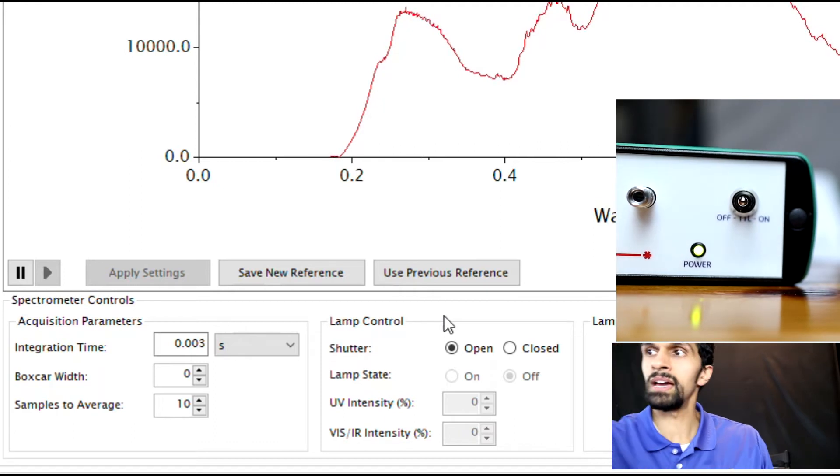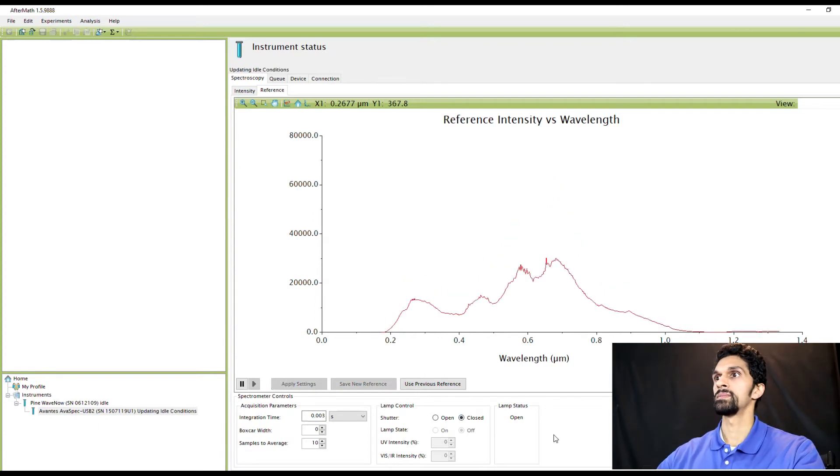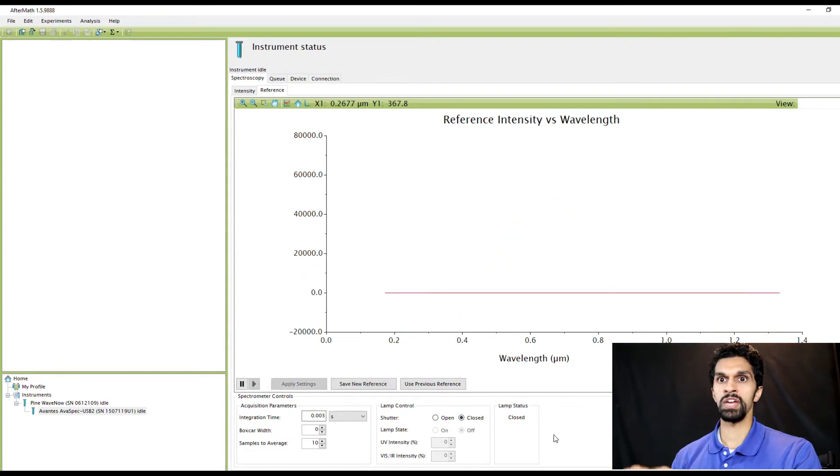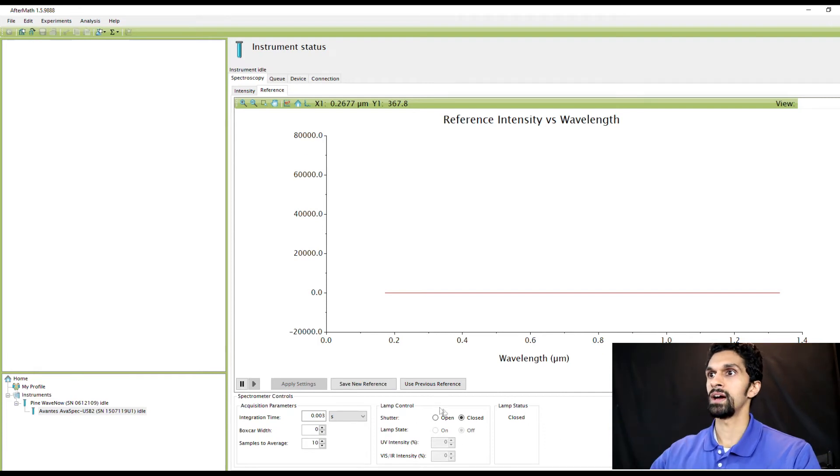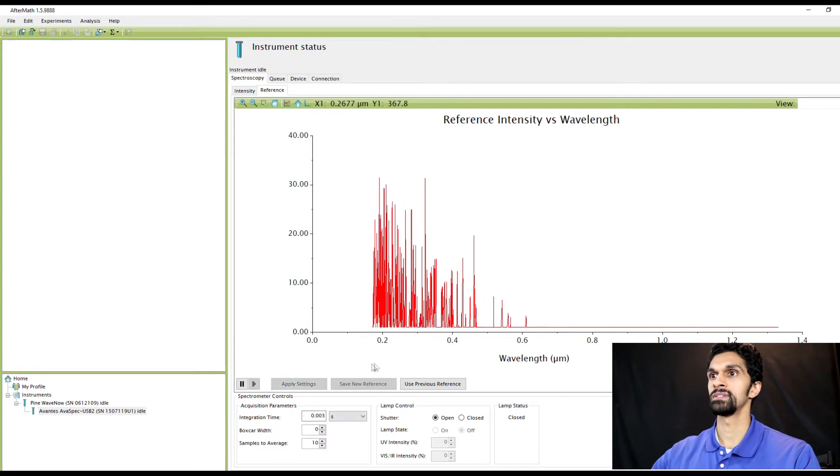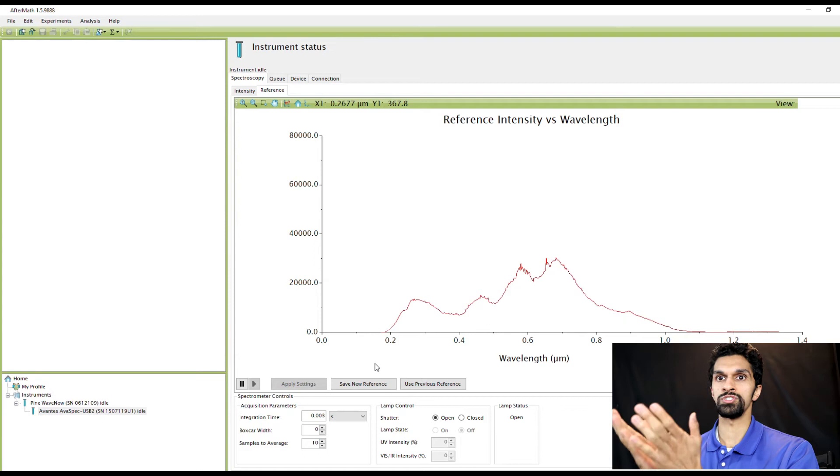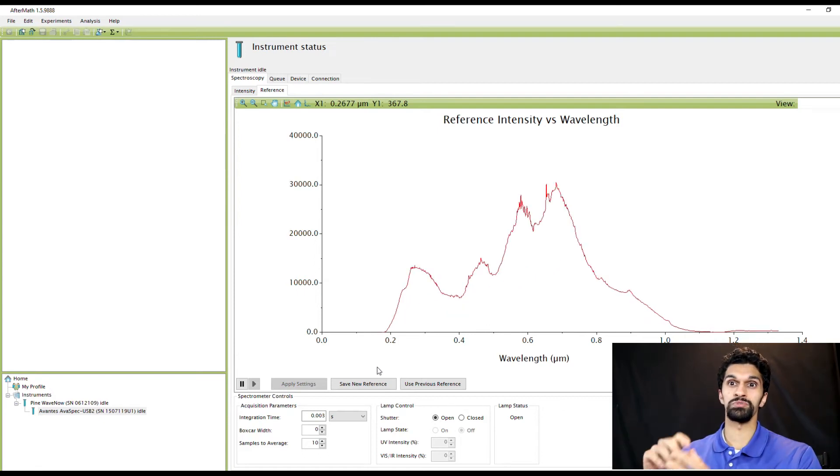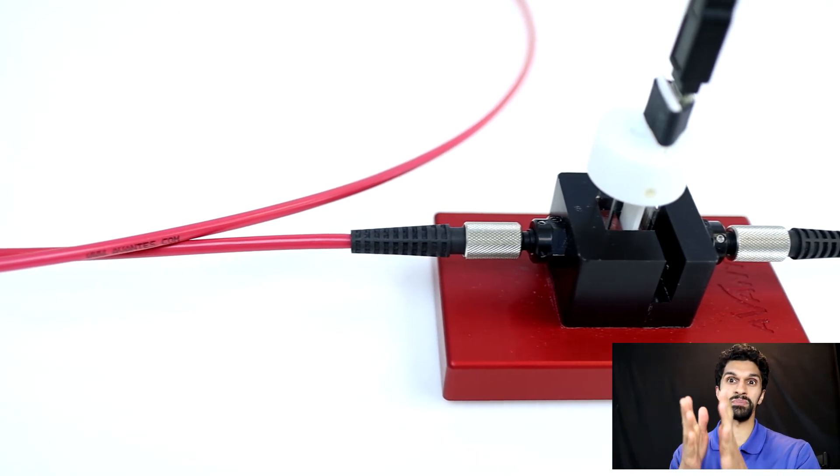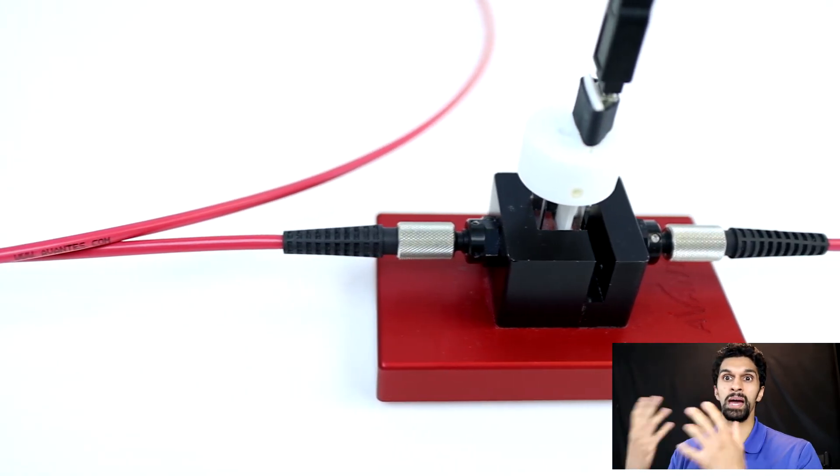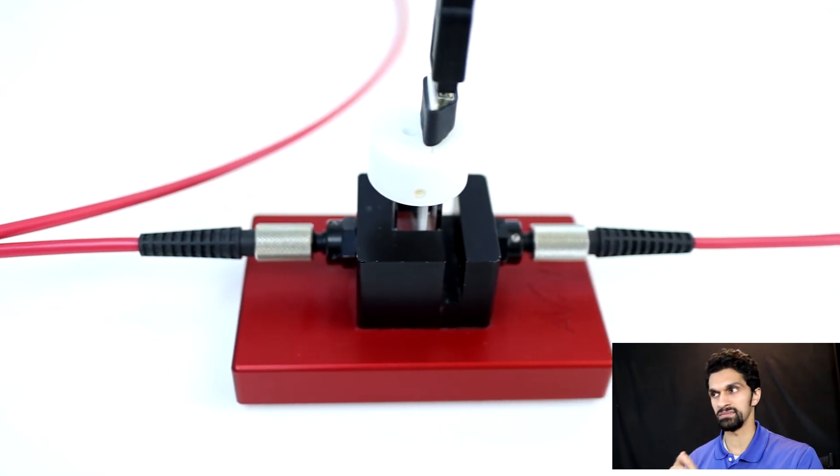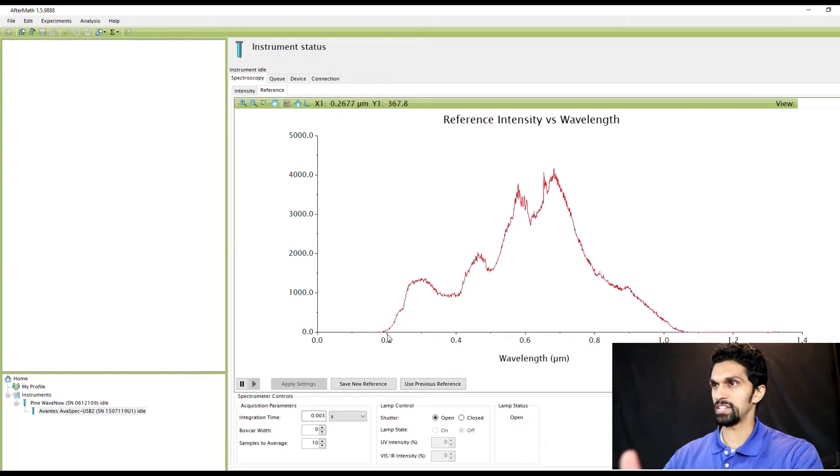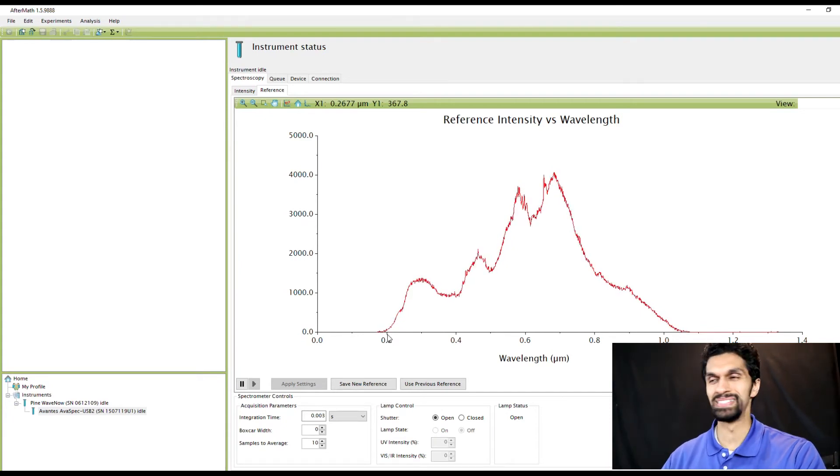Right now if I go to Close and hit Apply Settings, the shutter is closed and there's no light coming through the light source. I can then hit Open, hit Apply Settings, you'll hear a little click and now the light source is showing. Now if you give me one second I'm actually going to switch out the fiber optic cable from being connected directly from the light source to the spectrometer. I'm going to set up the honeycomb electrode. With the magic of editing you don't have to wait for it.